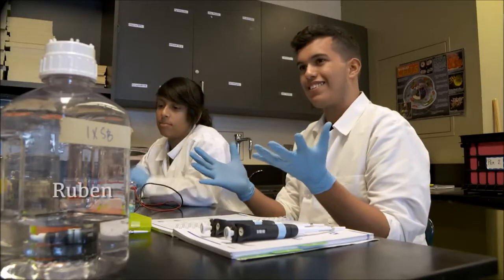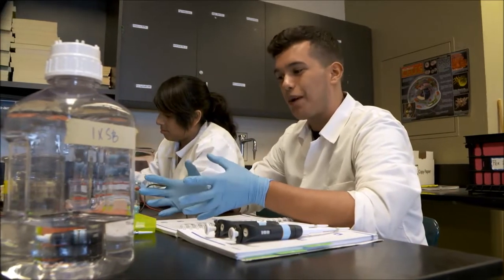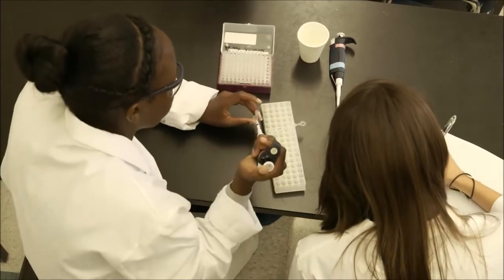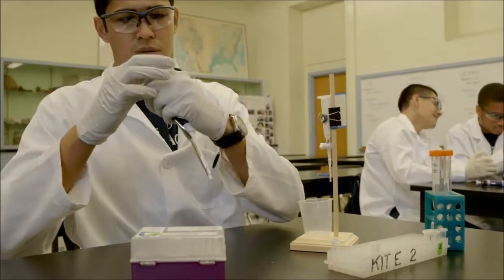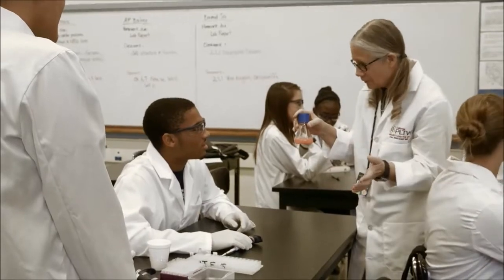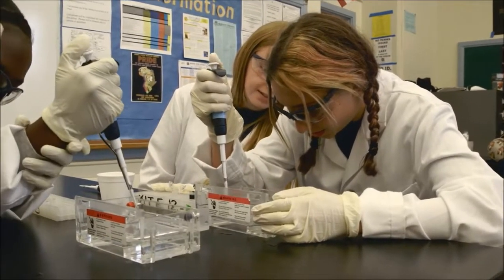It's basically all hands on deck. So basically you're controlling your whole experiment, you're running everything. It gives them that sense that I can be a scientist too. I can do these things. I know how to pipette, I know how to run a gel, I can streak plates, I can purify something on a column. Things that real scientists do in the laboratory.